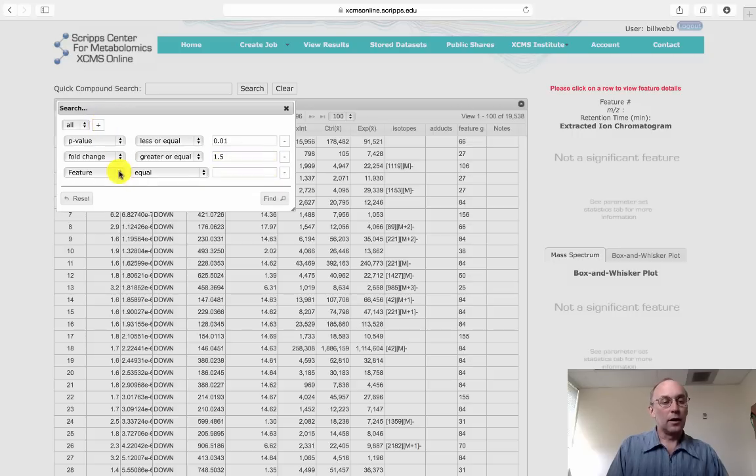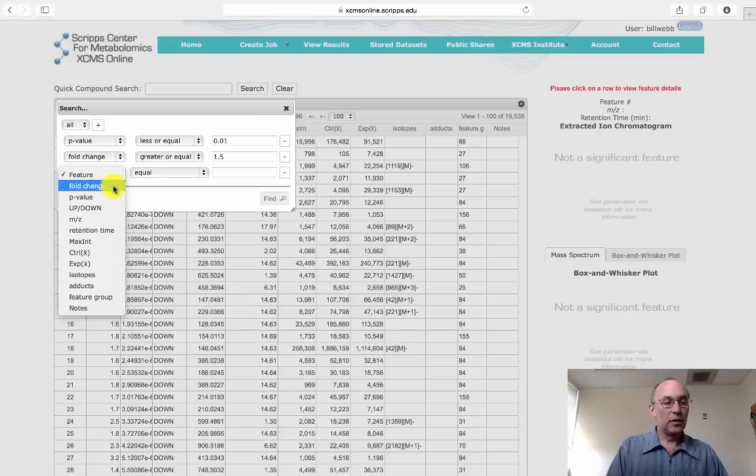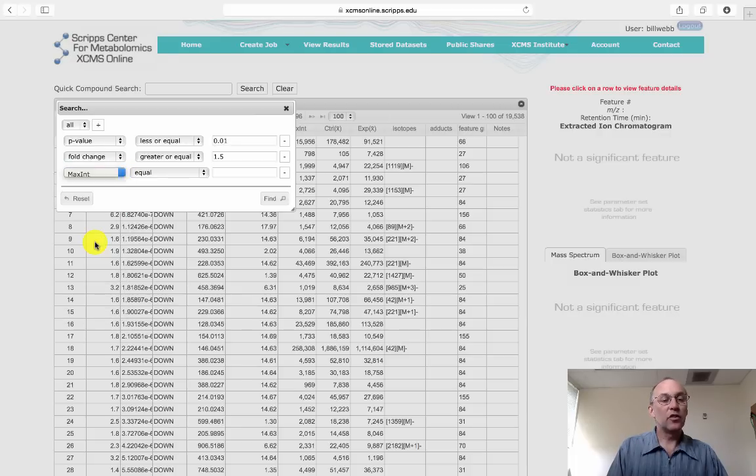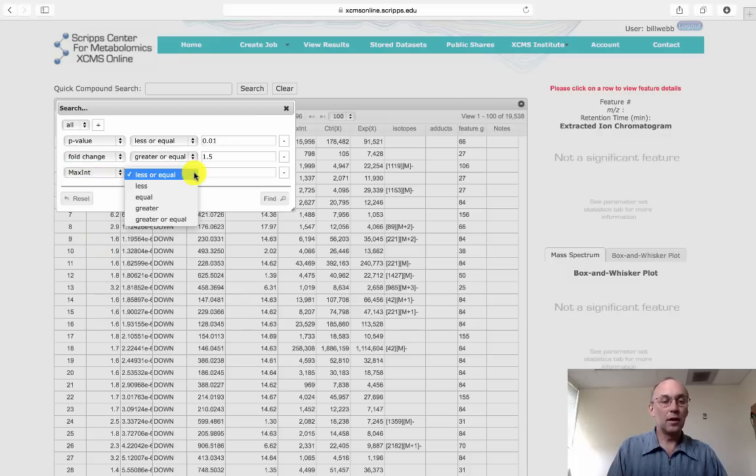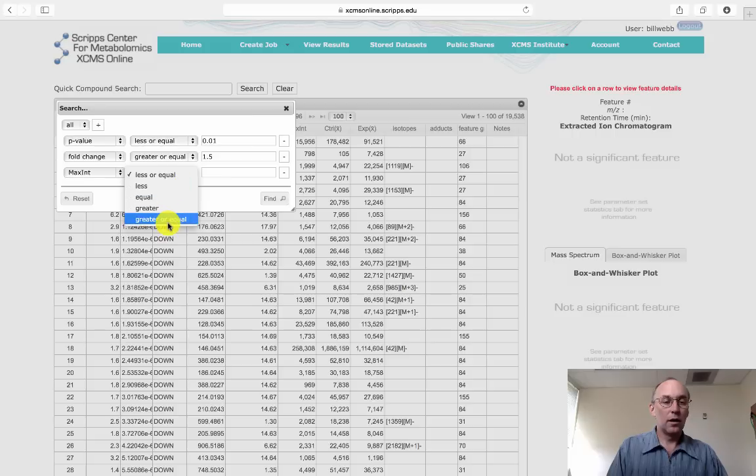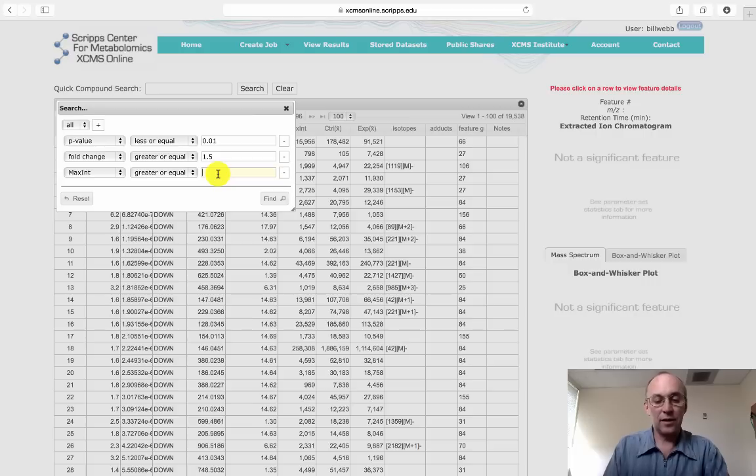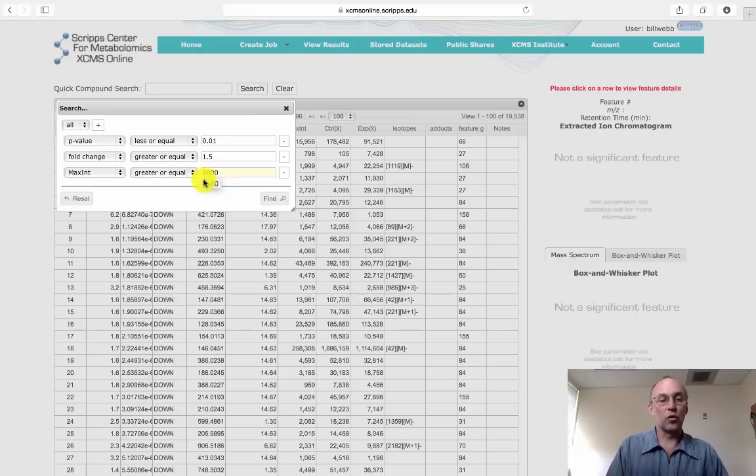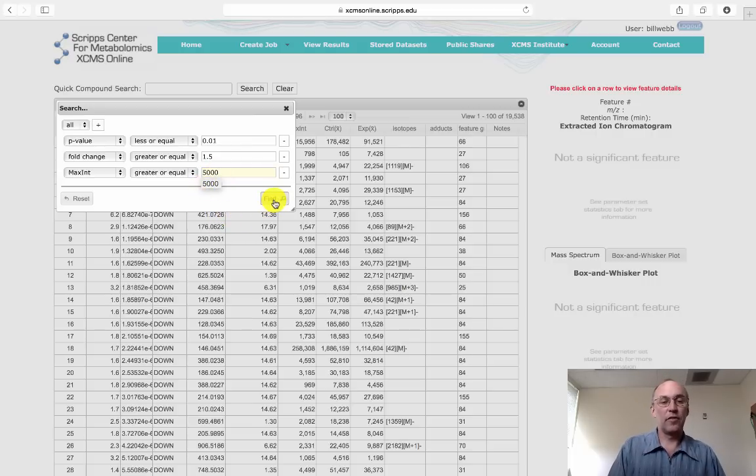And the last one we typically use is maxint, which stands for max intensity. And here, we'll only look at features that have an intensity value of 5,000 or greater. Then we click Find.